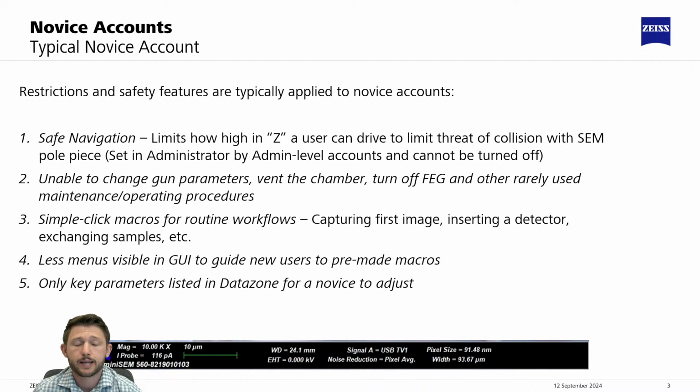Now, speaking about novice accounts specifically, what are the typical novice account settings? Well, there are a lot of restrictions and safety features that are put in place for a novice user, I think for obvious reasons. The first one I'd like to mention is safe navigation, which we're going to see in action in a second. So safe navigation is a built-in feature which will limit how high a user can drive the stage.